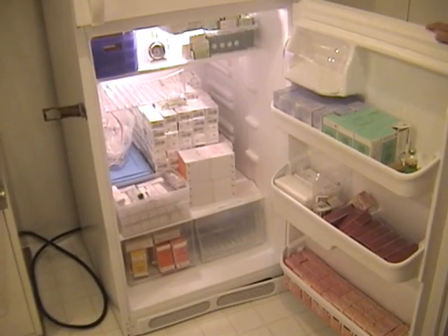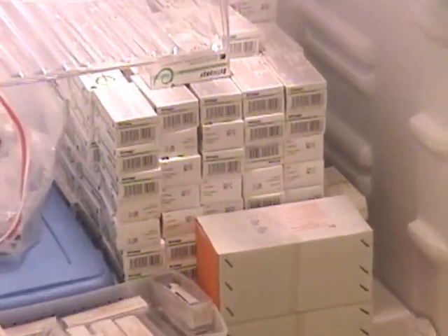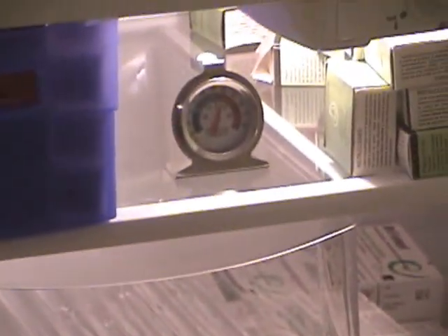This is our antivenom refrigerator, and this is where we keep antivenom for all of the animals that we can. As long as there's an antivenom made for it, we have that here on stock for any animal that we have.